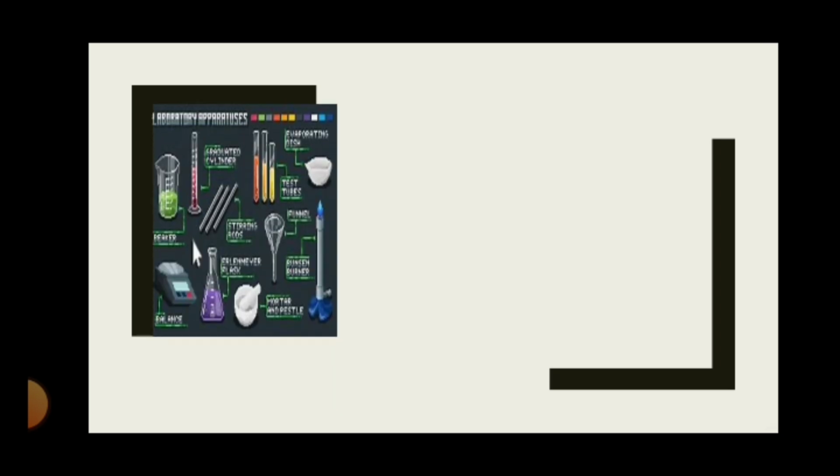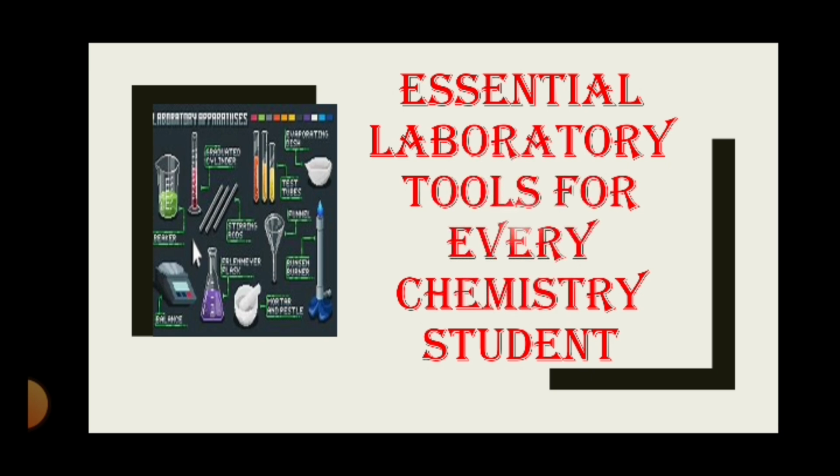You can see this in my PowerPoint. So what's the first slide, if you could see? Okay, what's the title? Essential Laboratory Tools for Every Chemistry Student. This is a revised edition of common laboratory apparatus. Of course, you will be expecting to learn in chemistry.